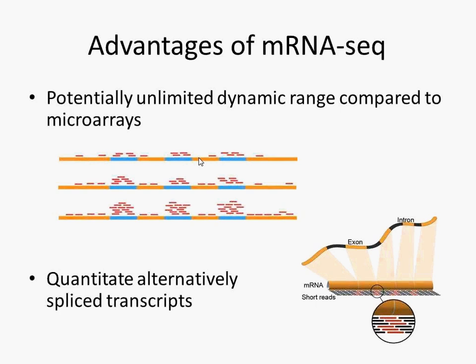So the expression level for that gene could come up as very low in a first analysis. But you could sequence the whole transcriptome at a deeper level, and then all of a sudden, the reads will start to stack up over these exons in a more significant way than on the background. Even though the background would get random reads scattered around, the exons would have a much higher number. So this way you could sequence more and more and detect very low expression genes.